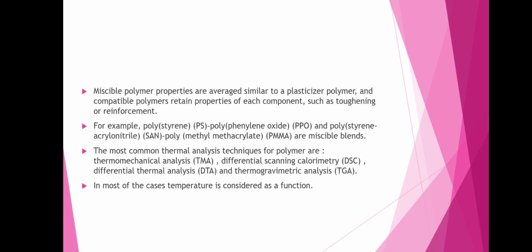The most common thermal analysis techniques for polymers are thermomechanical analysis, differential scanning calorimetry, differential thermal analysis, and thermogravimetric analysis. In most of the cases, temperature is considered as a function of it.